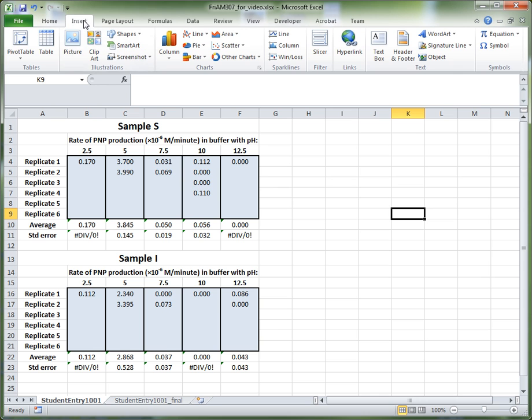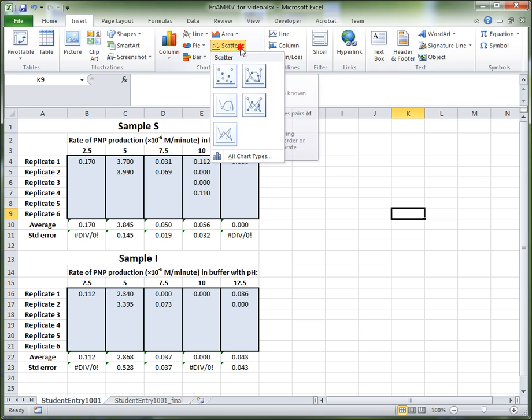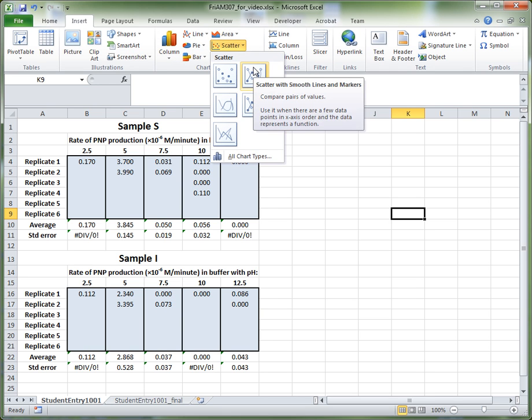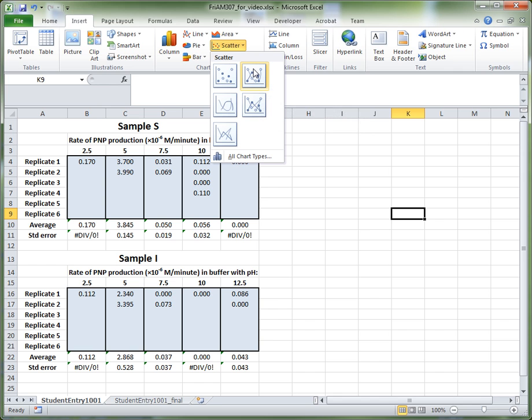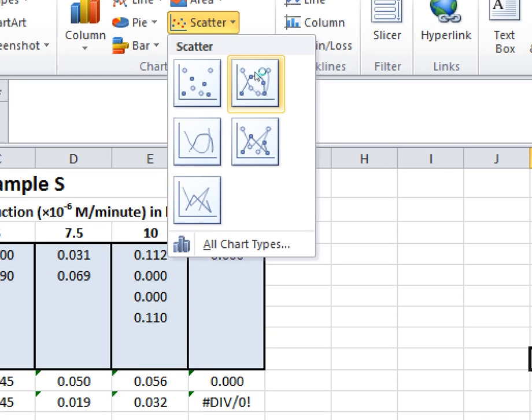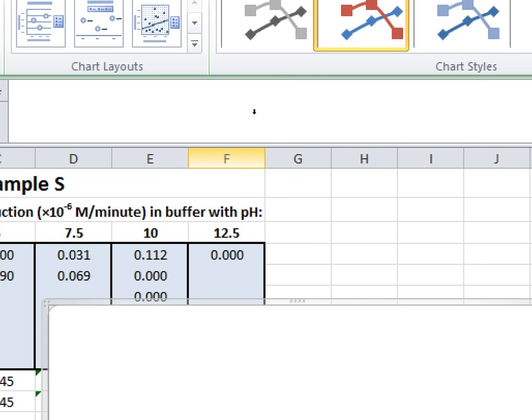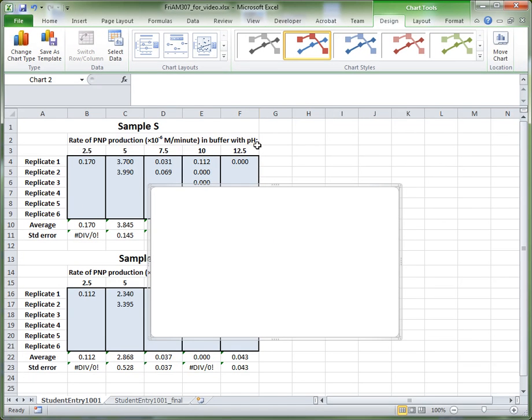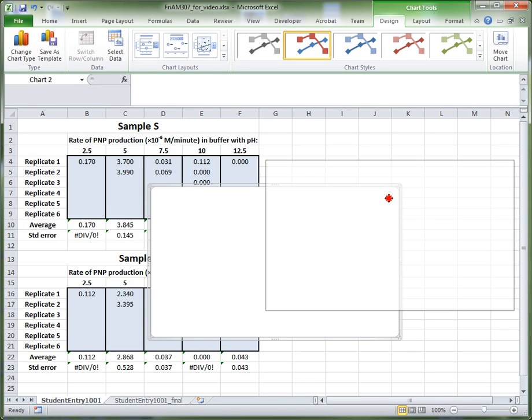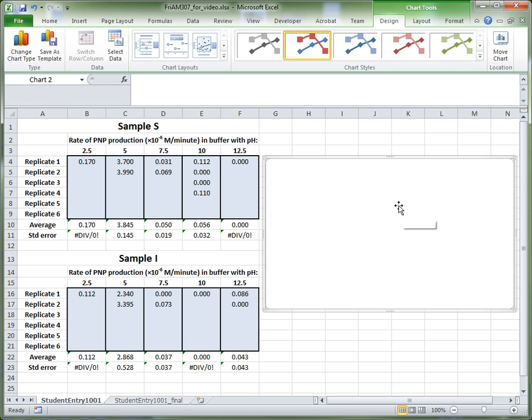Go up to the Insert tab. The Insert tab allows you to insert a scatter graph, so if you choose the scatter option, you want to choose scatter with smooth lines and markers. Click this option, and what that will open is essentially a blank graph. With this blank graph we need to actually tell Excel what to plot onto it.